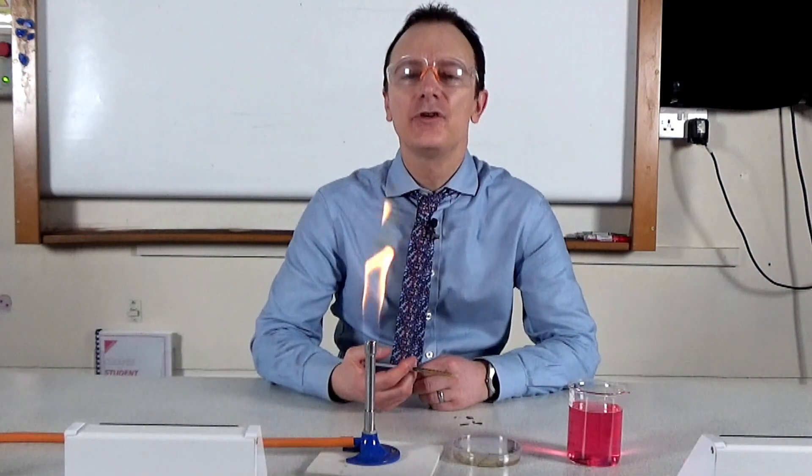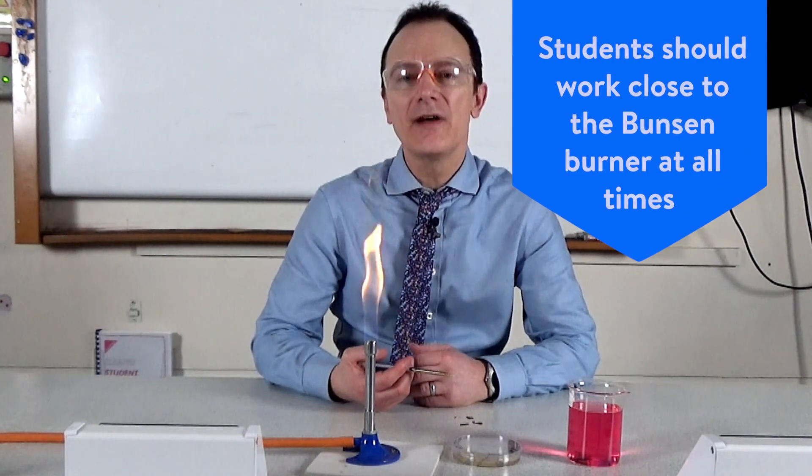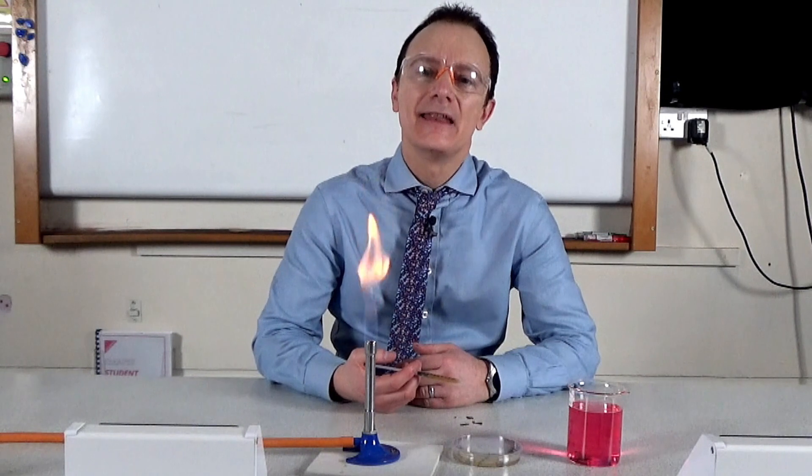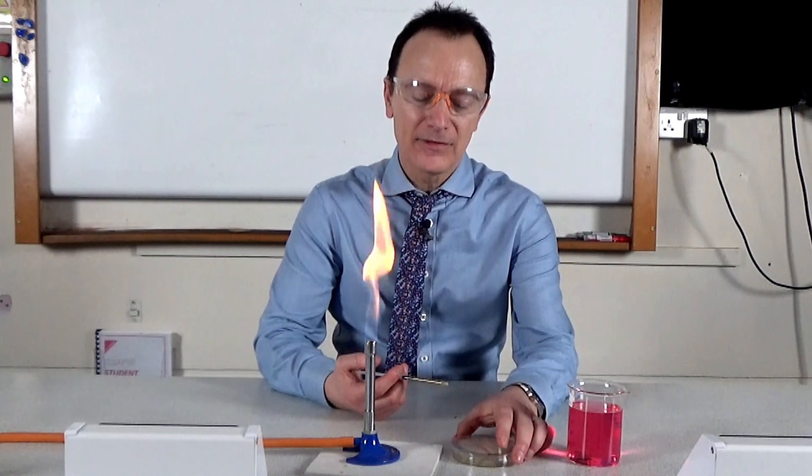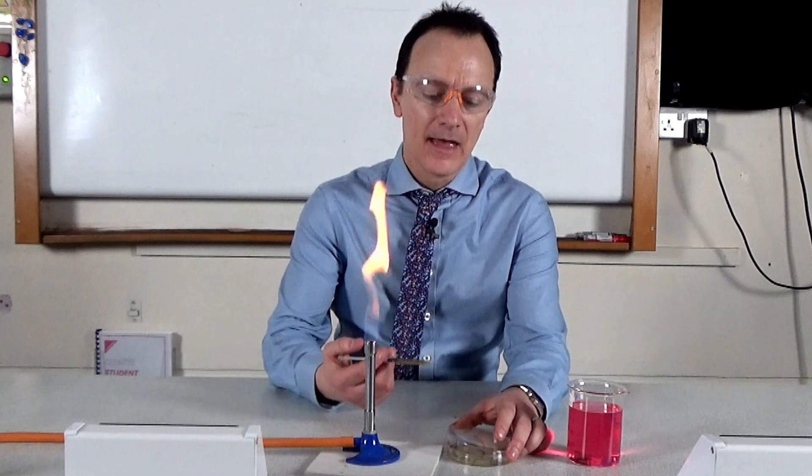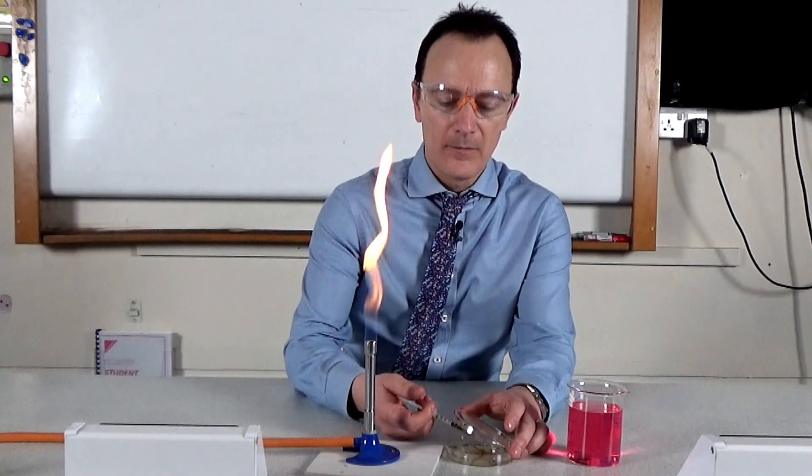It's important that your students work close to the Bunsen burner at all times, so that the convection currents can carry away any bacteria that they may be breathing out. They then lift the lid of the petri dish slightly and using the syringe, they discharge it into the petri dish.